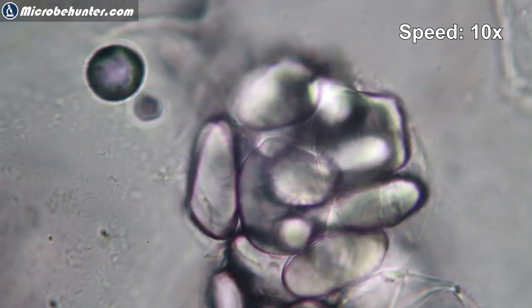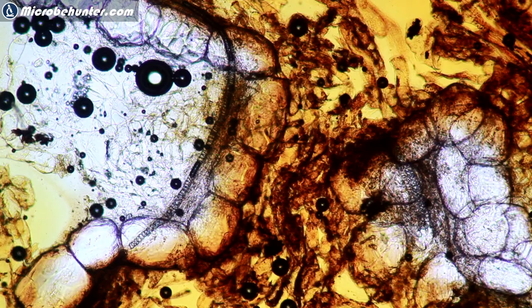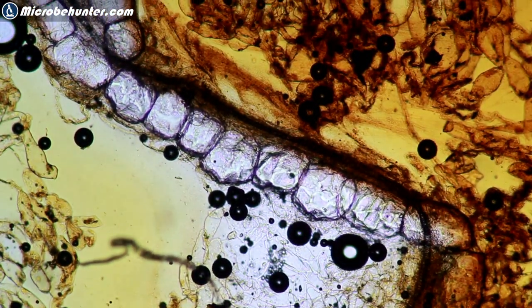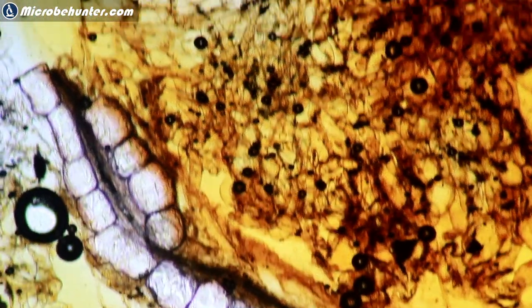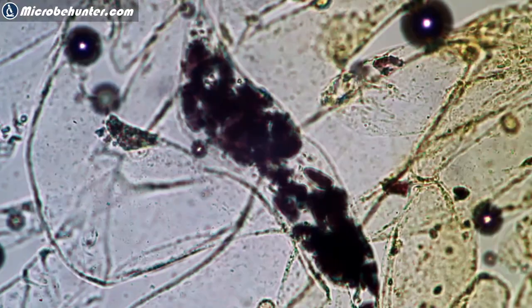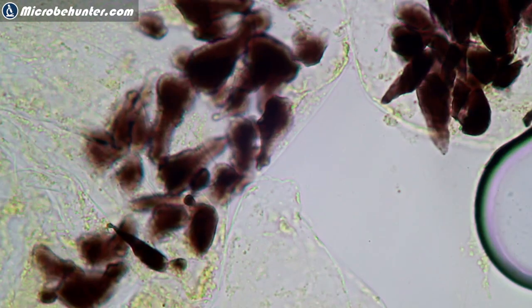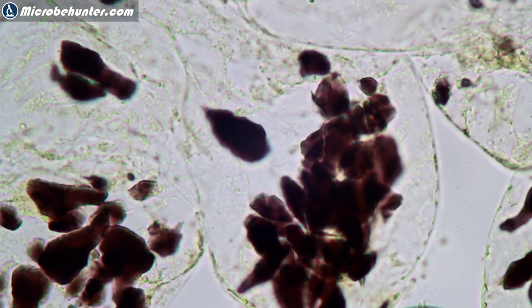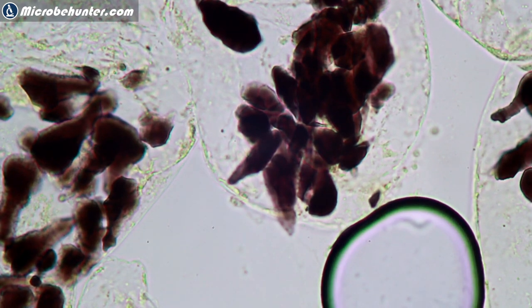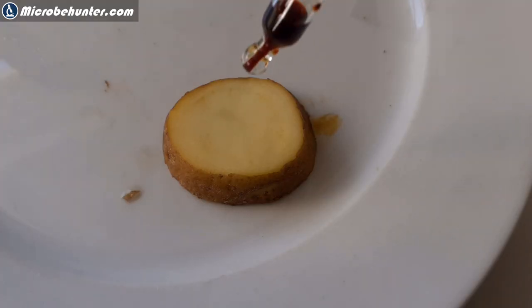So that is basically a very nice, easy experiment to do. Here is how the iodine solution in the banana looks — some parts are still white because the iodine was not able to reach those parts. As we move around we can also see different cell types, and inside some of the cells you can see those black starch grains. This is possible because the iodine stains them quite well even before you actually see the orange iodine. Do not use too concentrated an iodine solution.